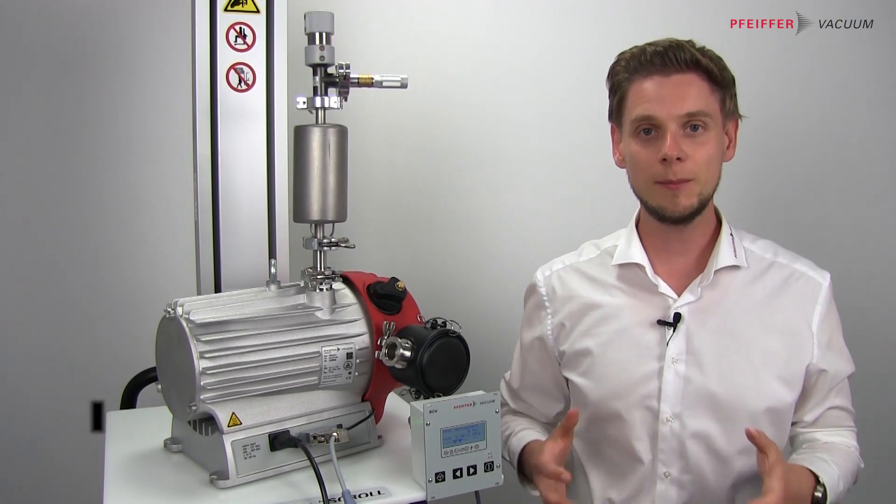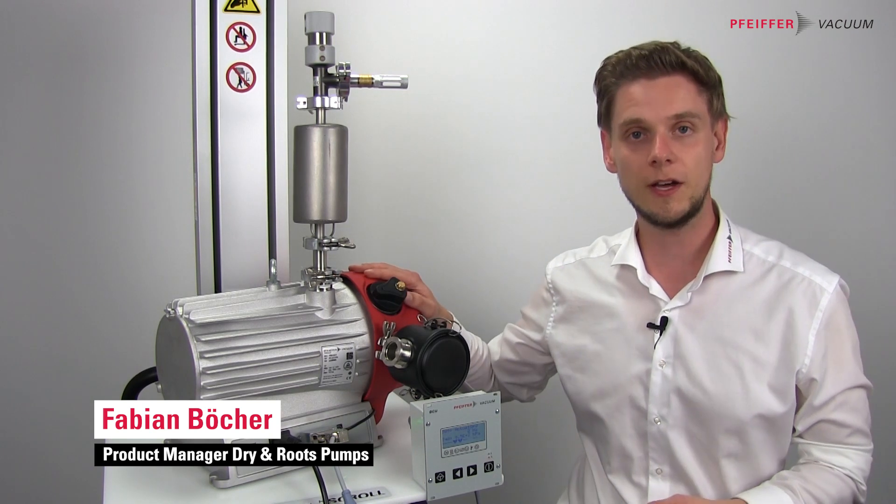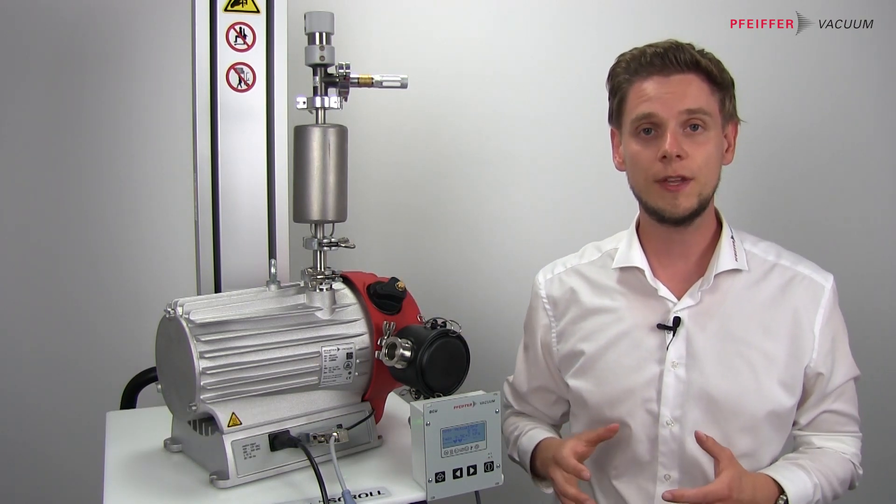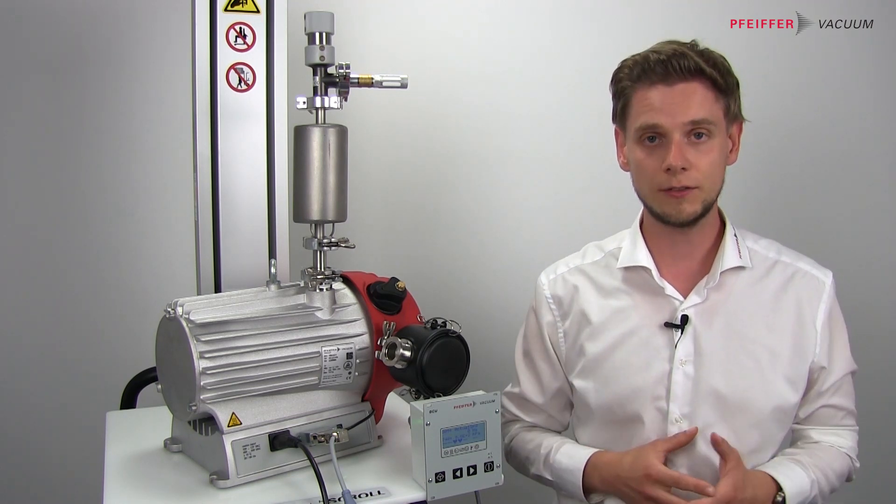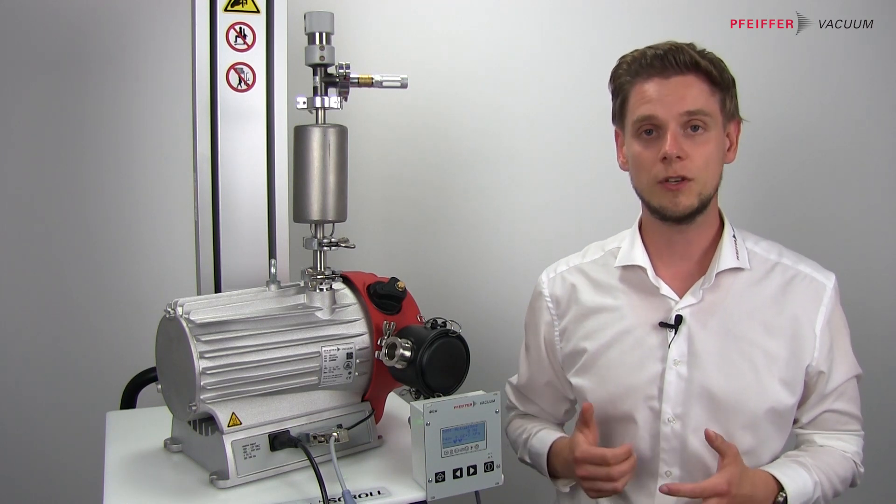Welcome back to Pfeiffer Vacuum. My name is Fabian and today I want to show you something new about the Pfeiffer Vacuum HiScroll. In the last video I showed you everything to set up your parameters together with the DCU and the HiScroll. Today it's all about three main features of the HiScroll.